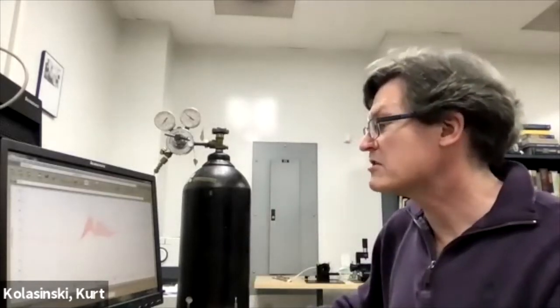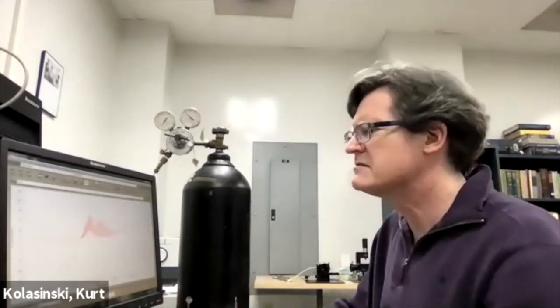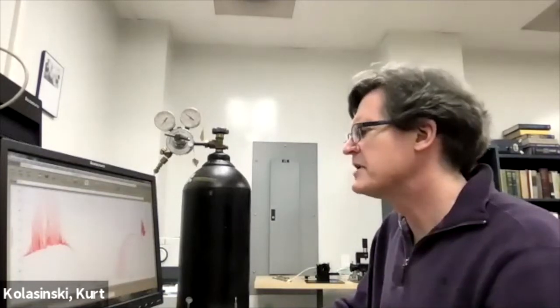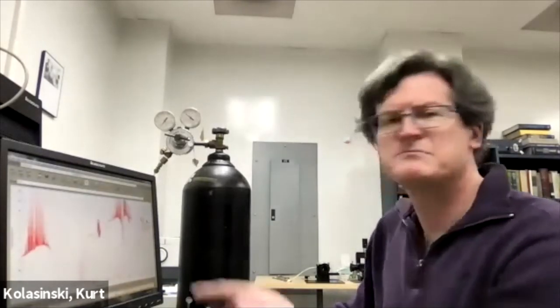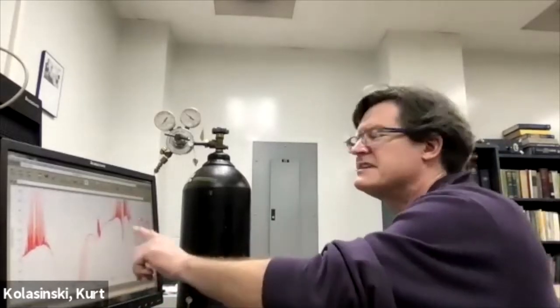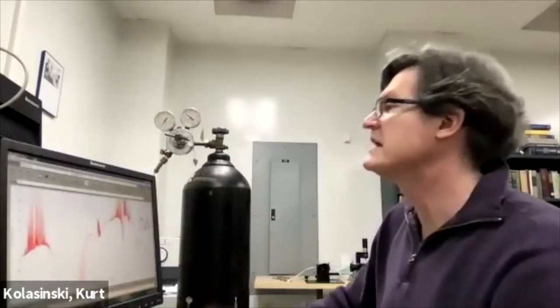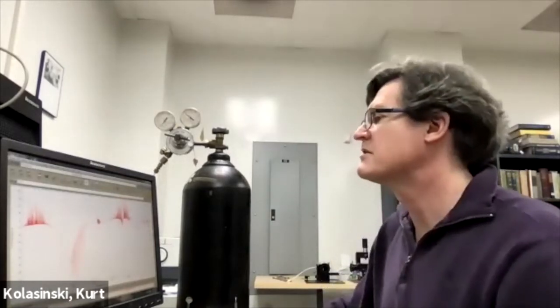There are little bars down below the spectrum. Down here, you can grab these bars if you need to open things up again. You can pick out which part of the spectrum you want to look at. Have some big lines here. That's water. That's water. Stuff in here, there's some glass peaks and whatnot, or big broad structures, and then there's some more water peaks way down at the end. If you need to change the scale, you can go full scale again under view. All right, that's where that is.